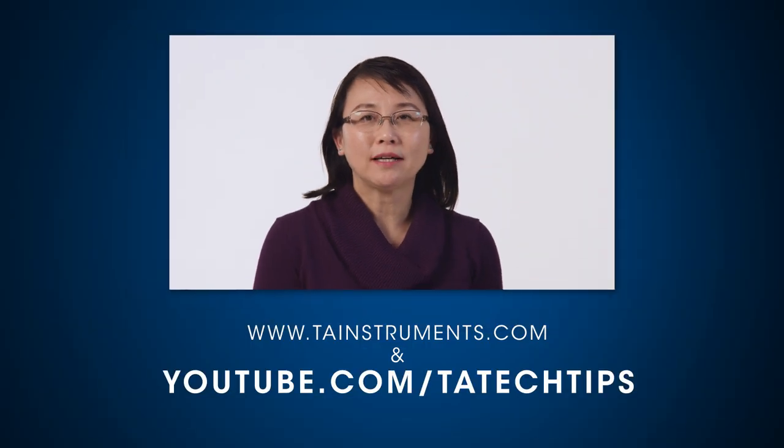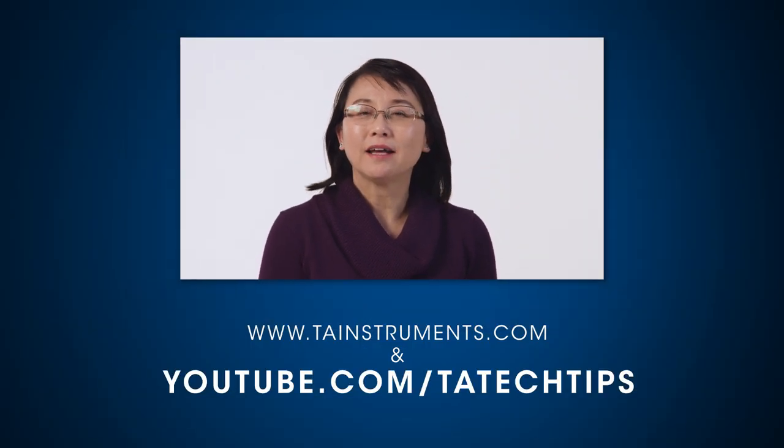In this TA Tech Tip, we have demonstrated how to install and calibrate a film tension clamp on a DMA-850. Please stay tuned for more TA Tech Tips, and thank you for your interest.